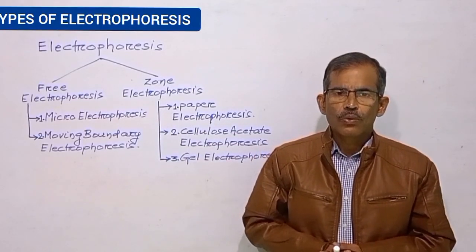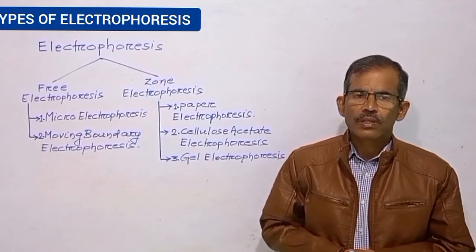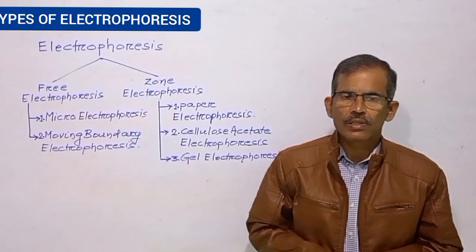Friends, today we shall discuss different types of electrophoresis.